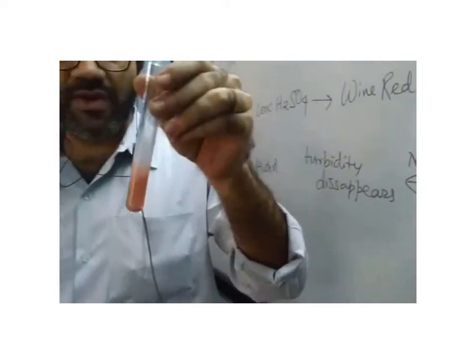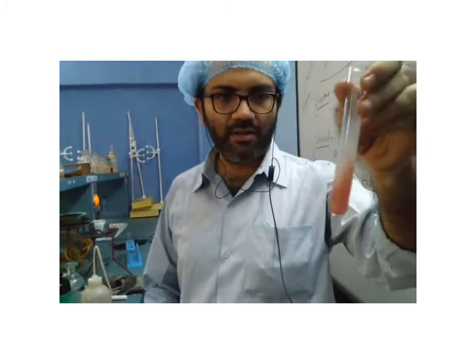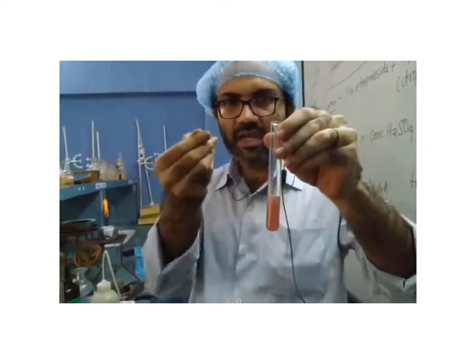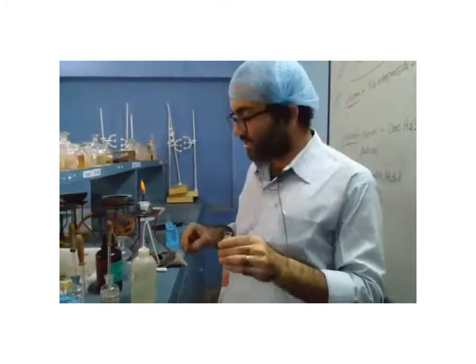This is one of the observations. Once again, I'm showing you intense turbidity. You can check it, you can see. Can you follow the turbidity over here? There's a turbid. That means insoluble things are forming. Now, what is our next step? What is the final one?